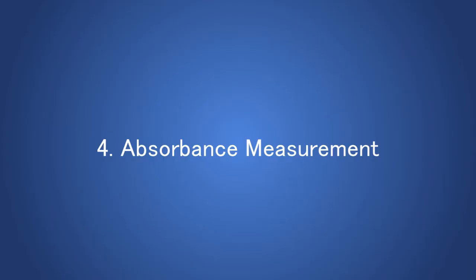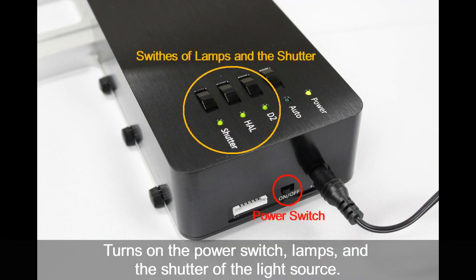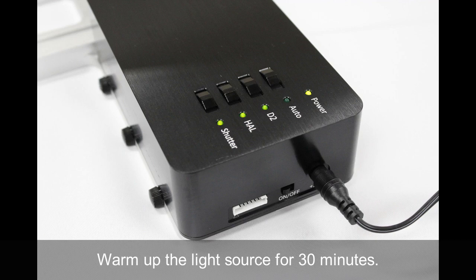Let's test the system with the absorbance measurement. Turn on the power switch, the D2 and halogen lamps, and the shutter of the light source. It is recommended to warm up the light source for about 30 minutes before starting the measurement.